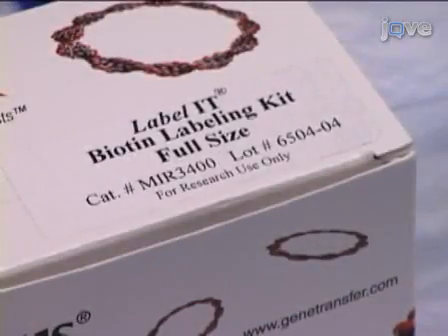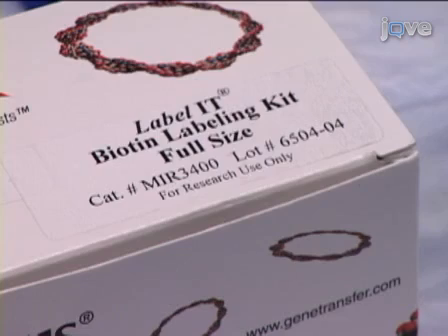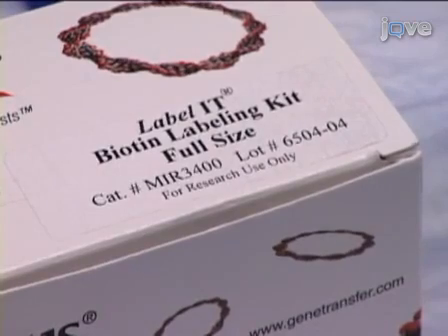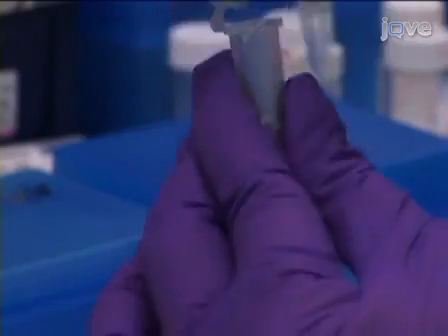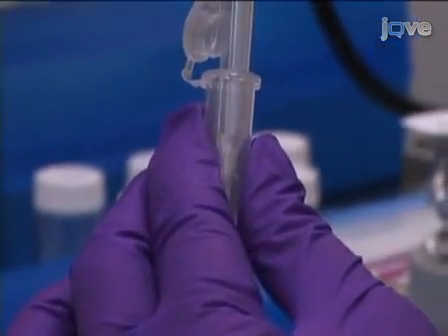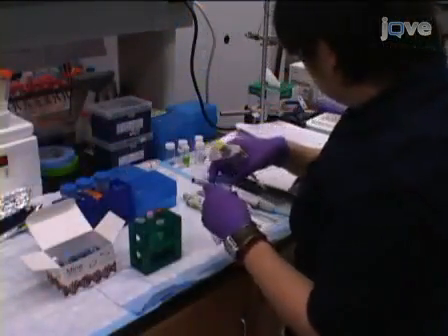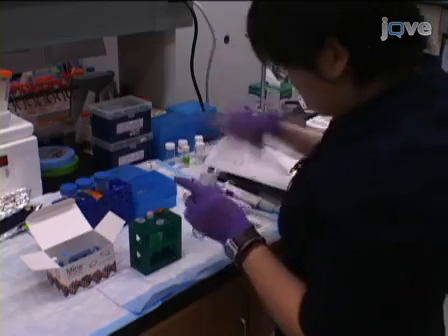A biotin labeling kit from Mirus Bio is used to covalently biotinylate plasmid DNA with guanine-specific biotin labels, scaled to have about 1–2 biotin labels per DNA. To begin, dissolve the desired amount of plasmid DNA into TE buffer to make a 1 microgram per microliter DNA solution. Set up the labeling reaction by mixing the plasmid DNA, DNase-free and RNase-free water, 10x labeling buffer A, and the labeling reagent.